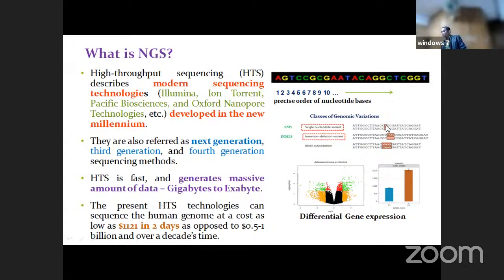You can see here, this is where C is there. For example, you have sequenced the second genome, and C changes to T. This is a SNP. But in the second one, there is an indel. You can see that GAT is present in the reference genome, whereas in the second genome GAT is deleted. That is what is called an insertion or deletion, or in other words, indels.